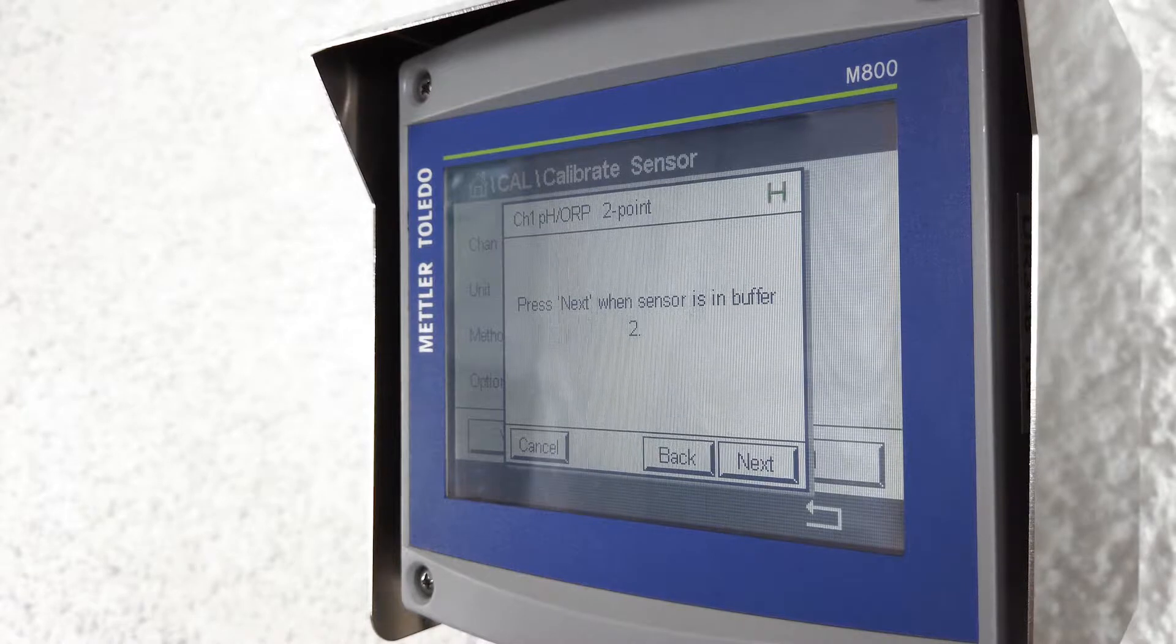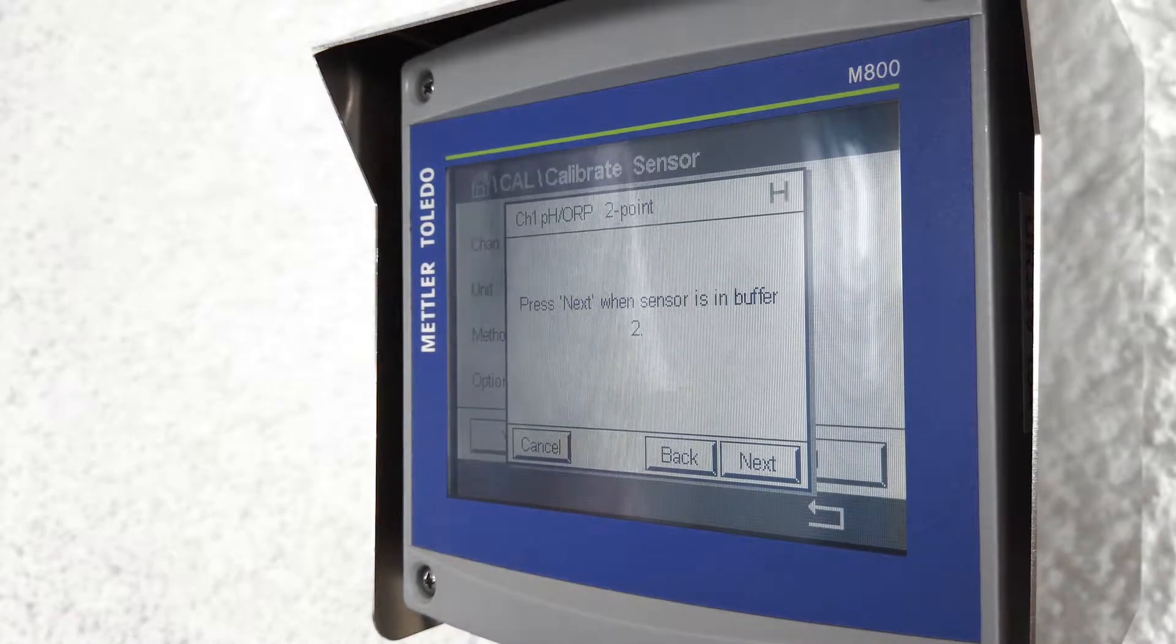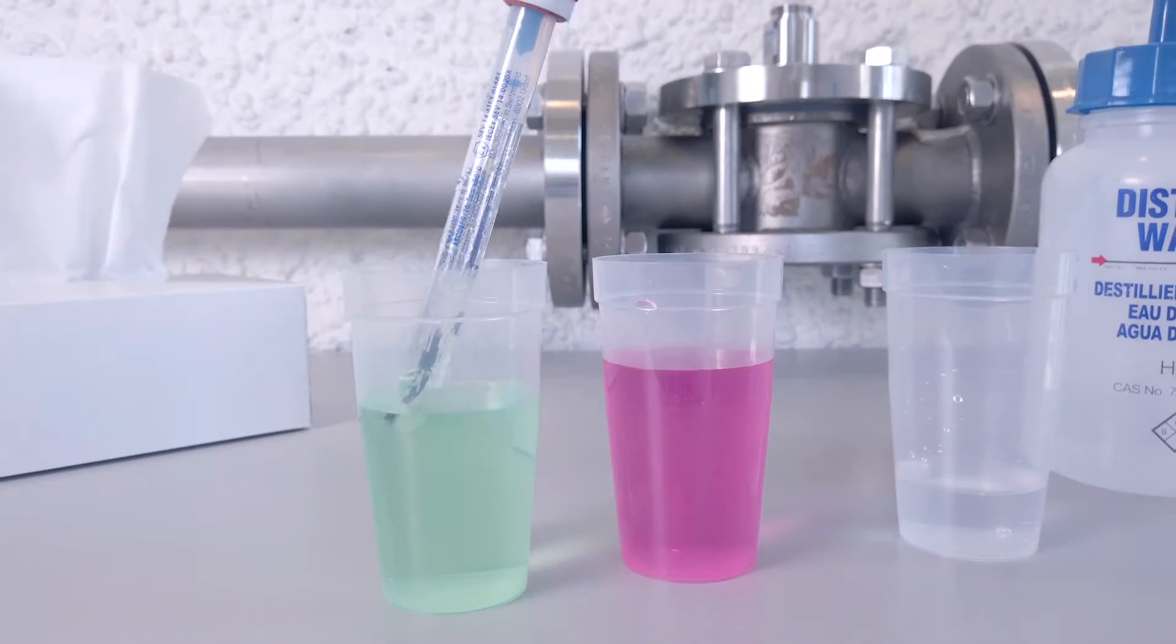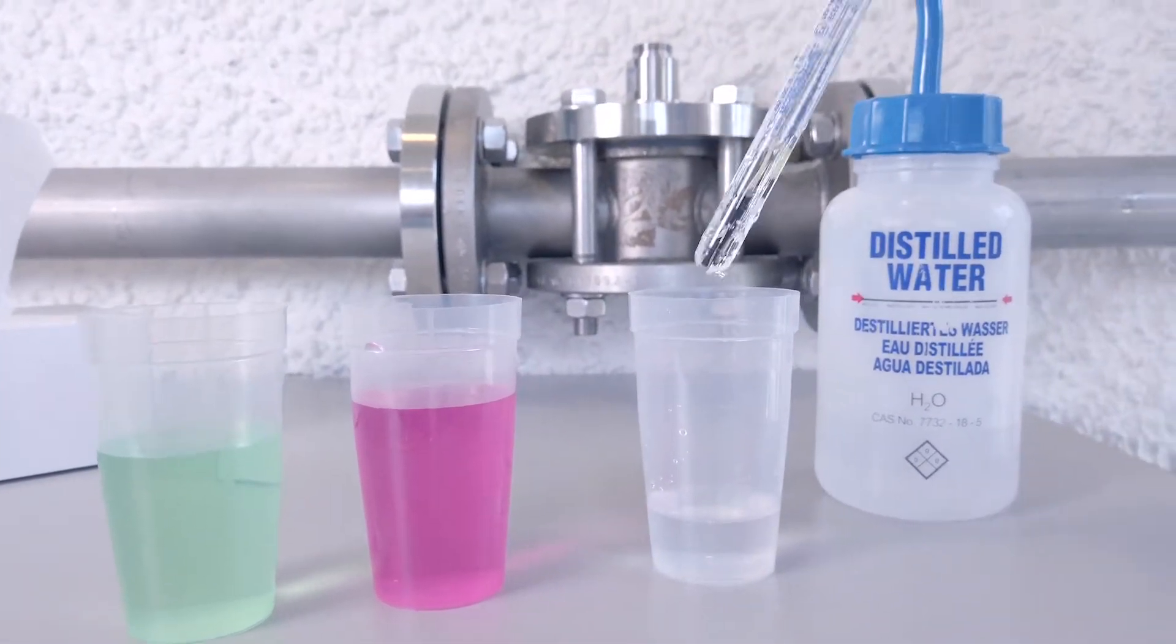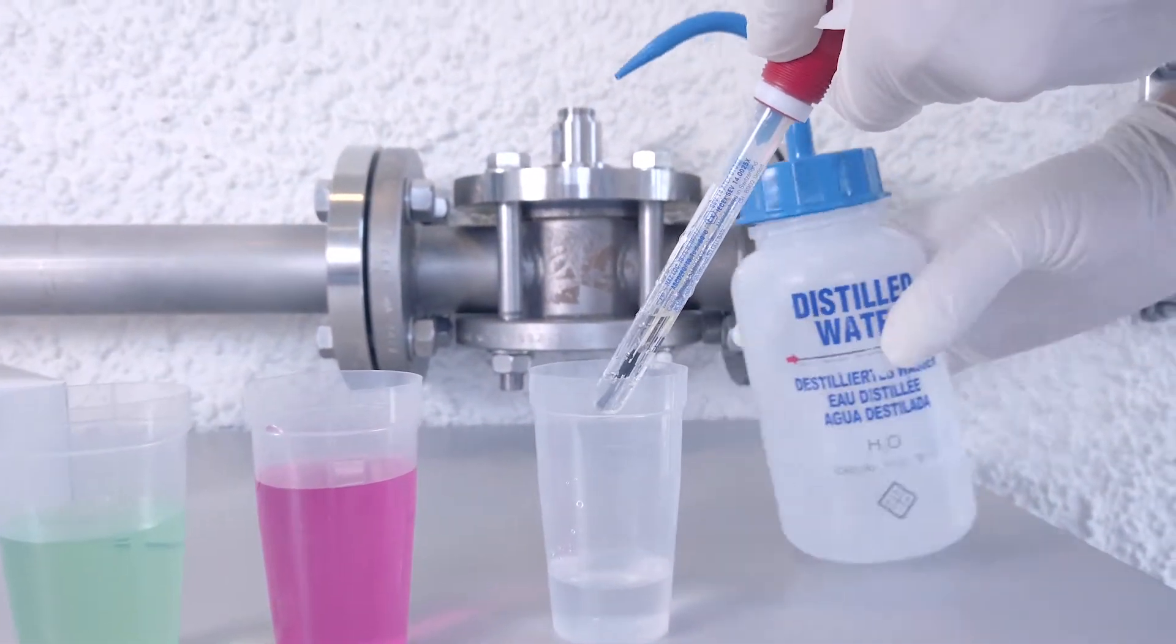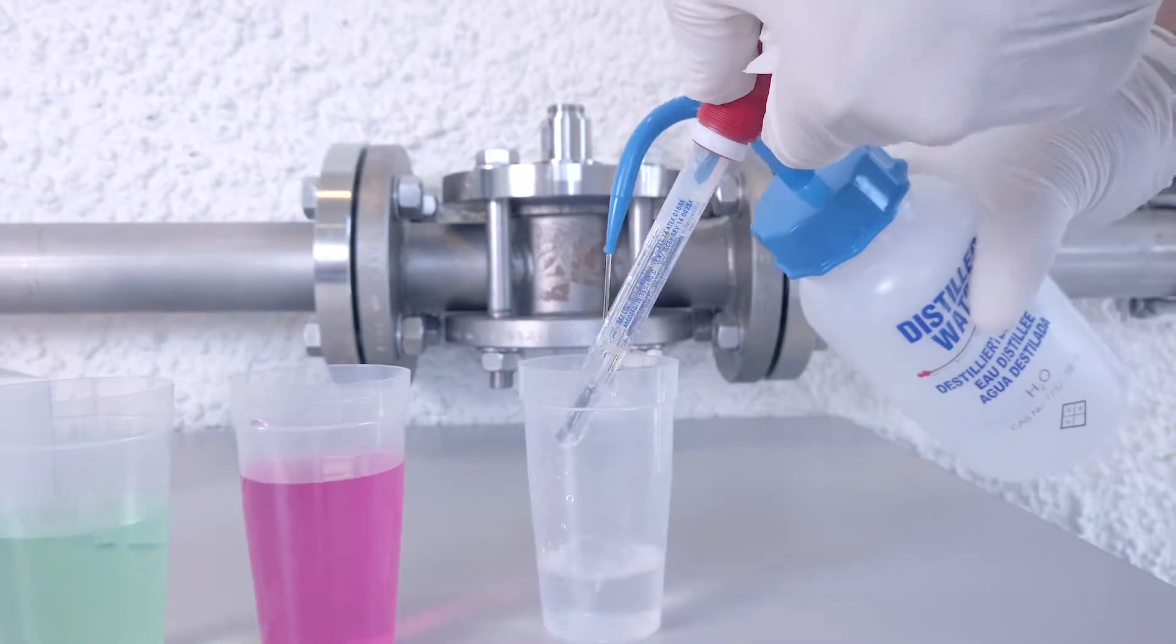Now the transmitter instructs you to put the sensor into the second buffer. In this case it's pH 4. Remove the sensor from the first buffer, rinse it again with distilled water, pat it dry and place it into the second buffer.